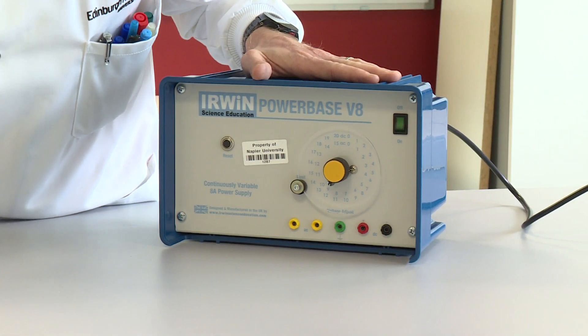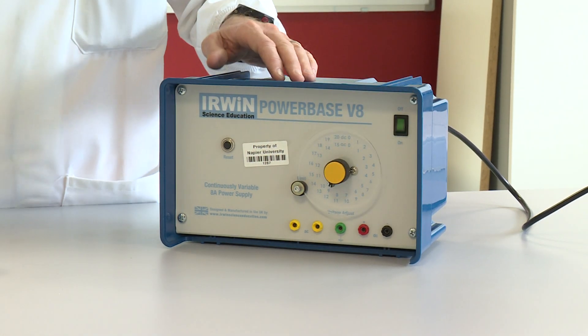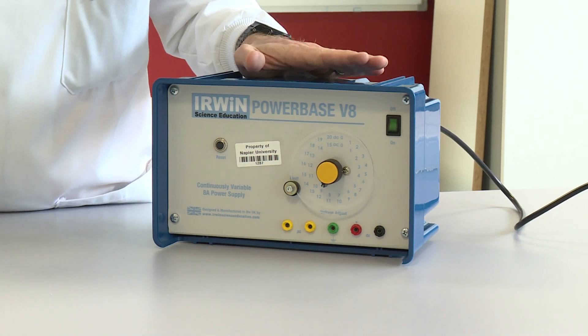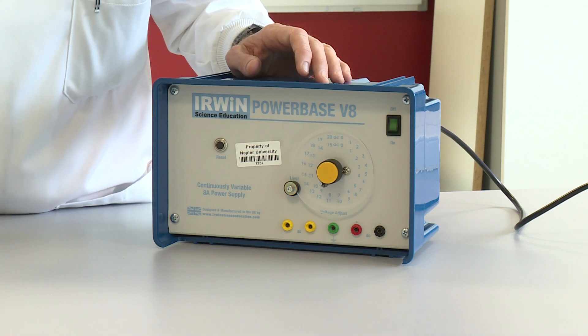This is the power supply that we're going to use. I've got it set at 12 volts and we're going to use the DC power supply — direct current — so that one electrode is continually positive, one electrode is continually negative, and that allows us to separate the two ions.